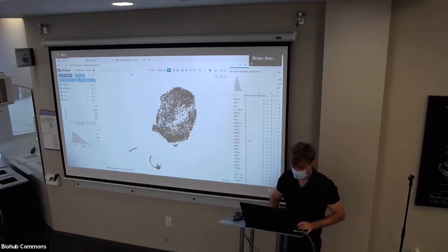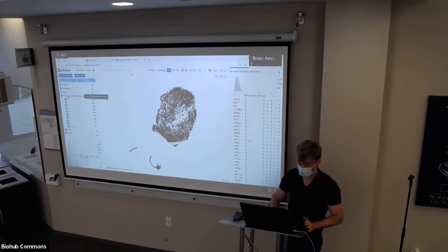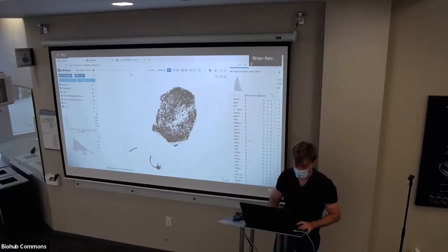So we'll click it. And now we have a nomenclature here. It's leiden_UMAP:kidney epithelial. So this is basically saying it's a Leiden clustering. The parent embedding is UMAP. There's a child embedding called kidney epithelial, and it's with resolution 1. This parameter here is a resolution parameter. The higher it is, the more clusters we'll get. So let's make it 3, just to show you what it looks like. And now we have resolution 1, resolution 3.